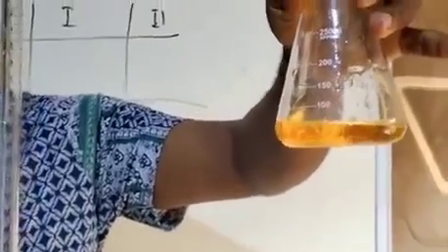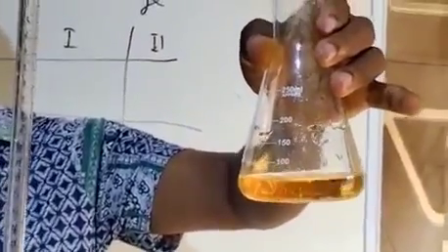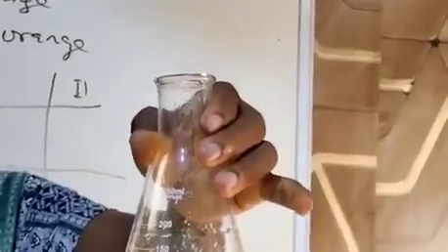So we have an orange color produced. You look at it, the difference is clear. Different from yellow. It's glittering in appearance. We have an orange color produced. And the volume of acid in the burette here is 20.70. The final volume, 20.70. So we'll go to the board and report.